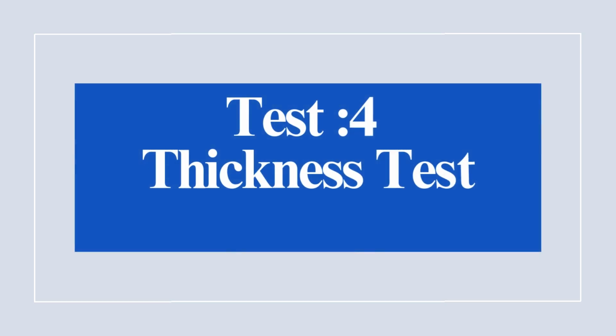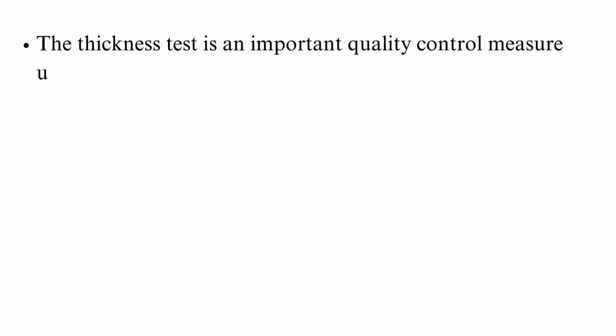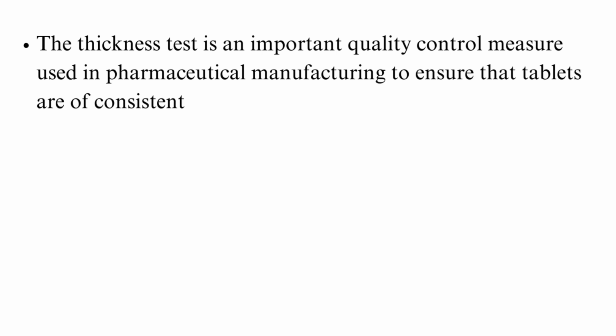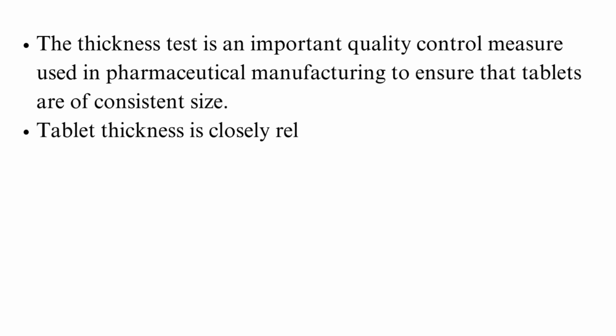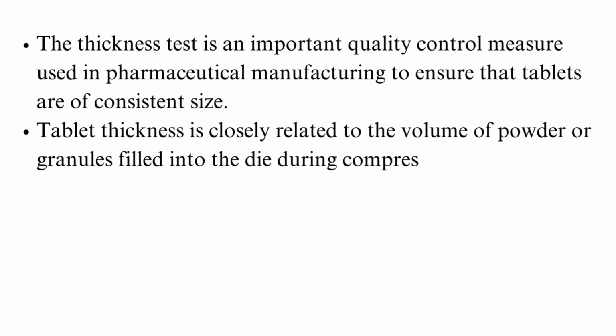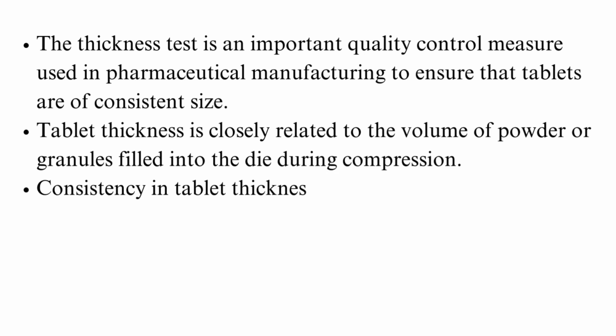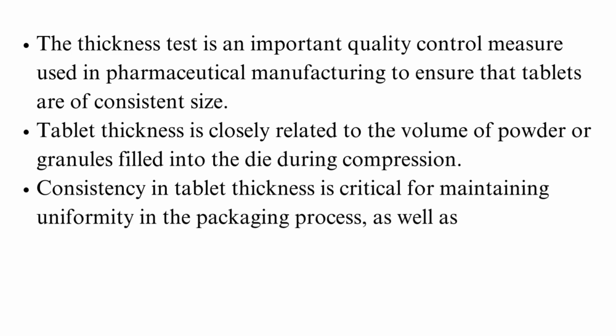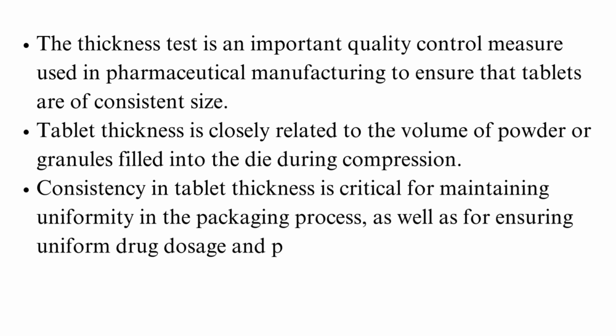Test 4. Thickness test. The thickness test is an important quality control measure used in pharmaceutical manufacturing to ensure that tablets are of consistent size. Tablet thickness is closely related to the volume of powder or granules filled into the die during compression.